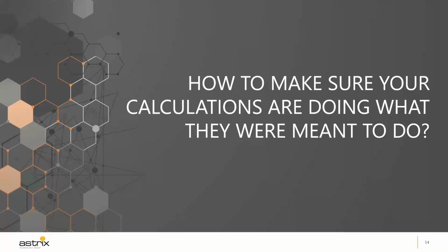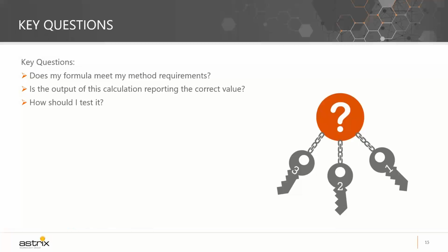Okay, thanks, Anna. So now that we've seen that Empower has lots of functionalities and lots of possibilities for calculations, having data integrity in mind, how can we make sure that whatever calculations I created are doing what they were meant to do and that I capture enough evidence of that? So, key questions to think about this.